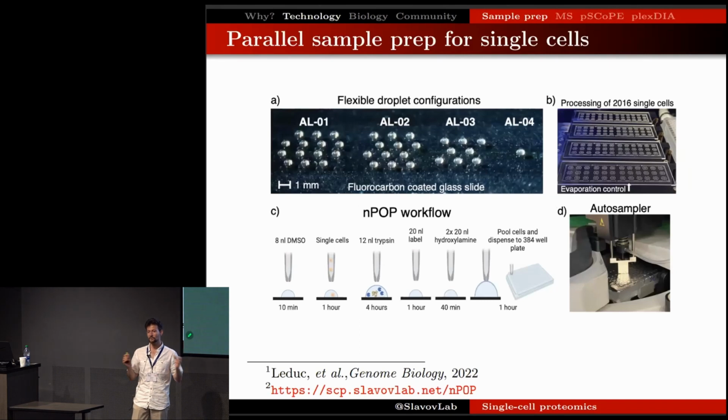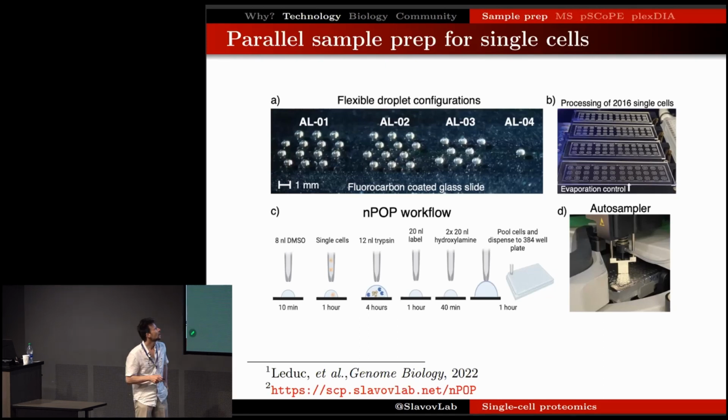Before I had measured any proteins in single cells, I had started thinking about sample prep, and the dream was that we'll be able to do the sample prep on a glass slide, just a regular microscopic glass slide that doesn't have any patterning. We don't need expensive chips, just a simple glass slide where we can do the sample preparation in droplets. And Andrew Leduc, a doctoral student in my group, helped realize the dream where here, as you can see, we can lay out thousands of droplets on regular microscopic glass slides.